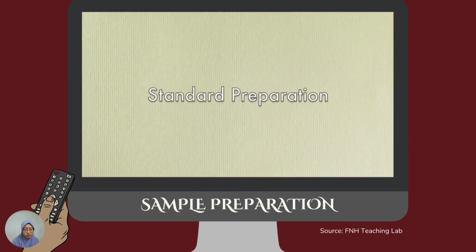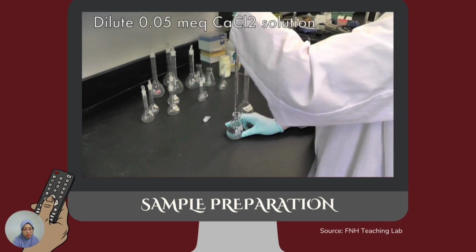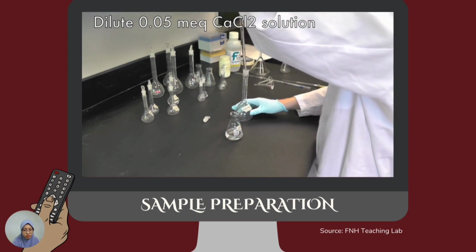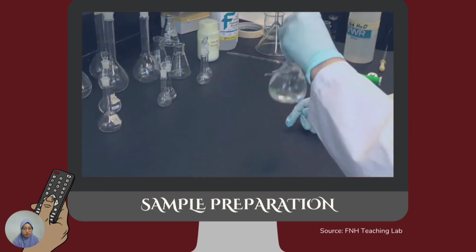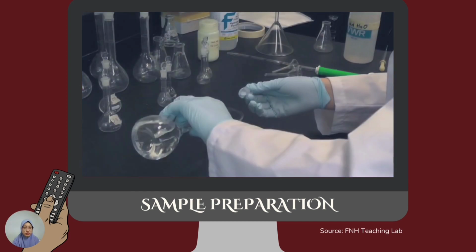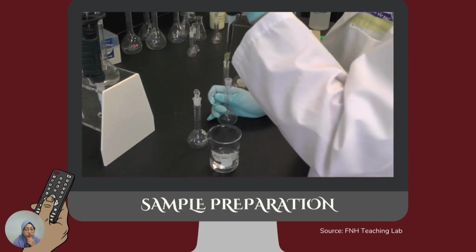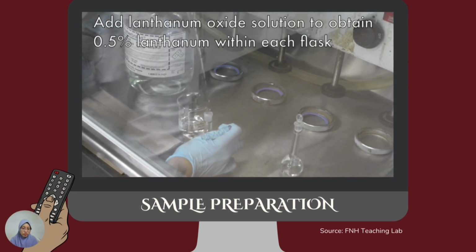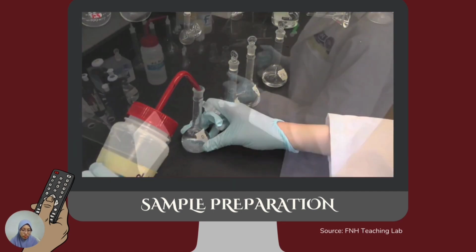During the wait time in the sample preparation steps, you can begin preparing your standards. First, dilute the 0.05 milliequivalent calcium chloride standard solution by pipetting an appropriate amount of the solution into a 100 milliliter volumetric flask labeled 100 micrograms of calcium per milliliter. Add DD water to volume. Invert a few times to mix. Then label the 25 milliliter volumetric flasks with concentrations 0, 0.5, 1.0, and 2.0 micrograms of calcium per milliliter. Pipette the required amount of the 100 microgram calcium per milliliter solution into each of the 25 milliliter volumetric flasks. Then pipette the required amount of 2.5% lanthanum oxide solution to obtain 0.5% lanthanum oxide in the standards. Make up the volume with DD water and invert to mix.